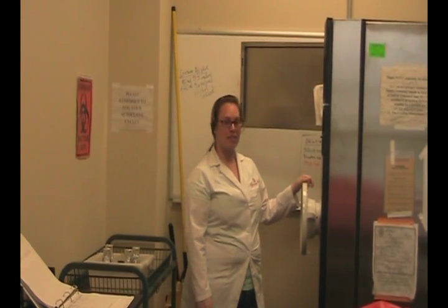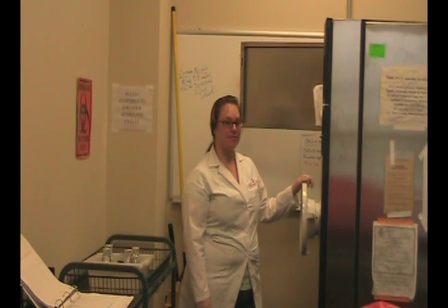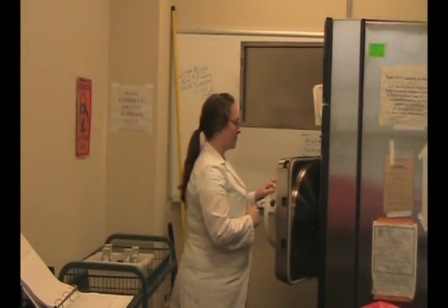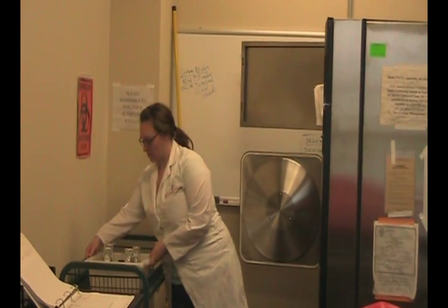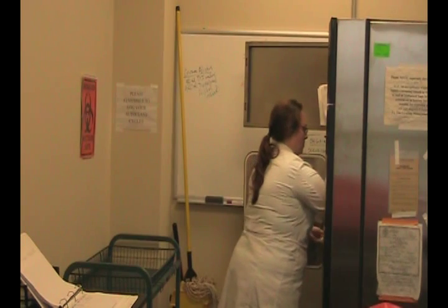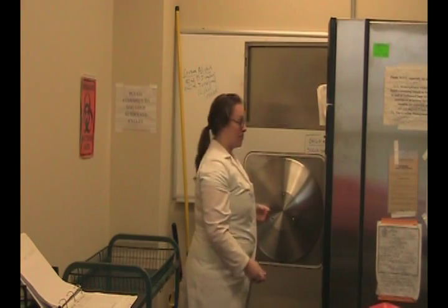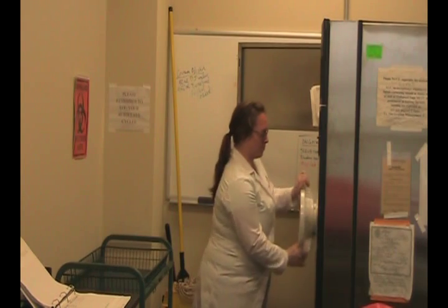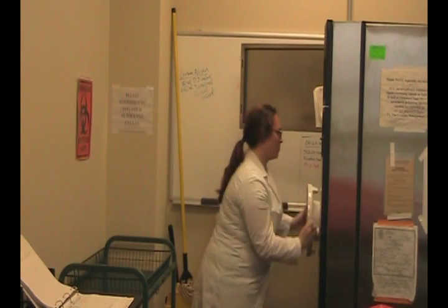Now that the pressure has gone above 15 psi in the jacket, we can go ahead and load our things into the autoclave. Open the door — be very careful, it's on a weird hinge, so the whole thing kind of comes out. Slide your items in. Be careful not to touch the sides — it's really hot in there. Close the door.